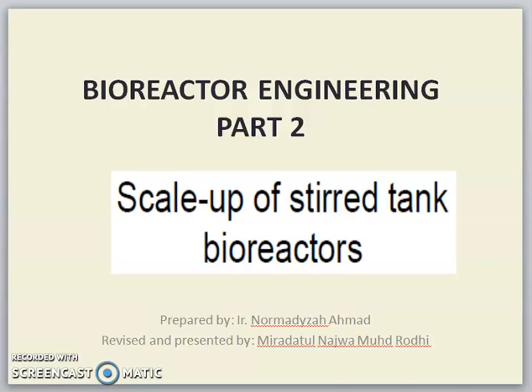Assalamualaikum. Hi. This presentation is on the second part of topic 5 on bioreactor engineering. In this presentation, we're going to look at the scaling up of stirred tank bioreactors.